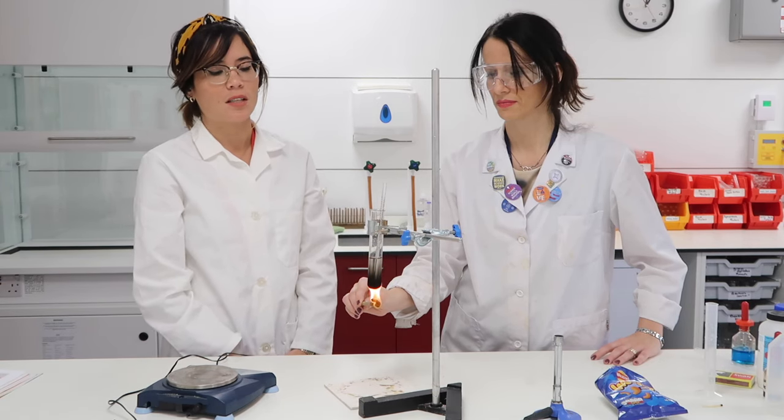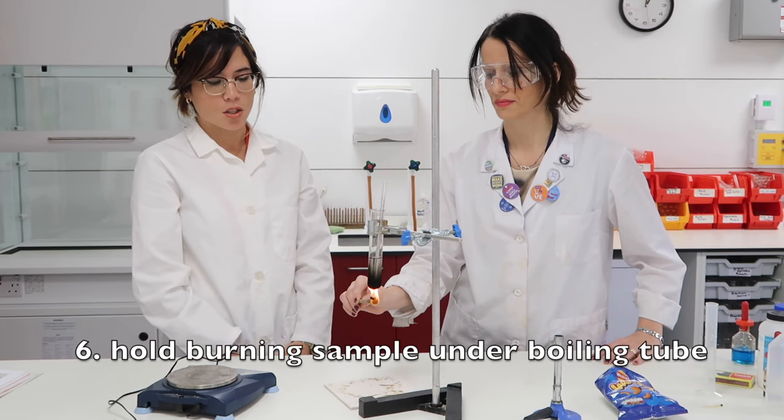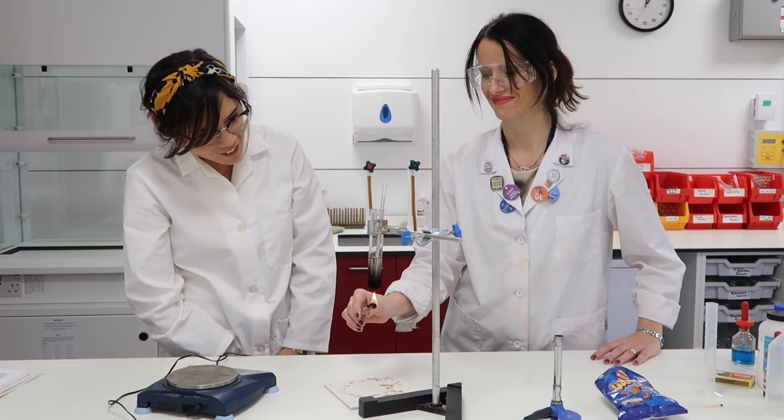Now this is the crucial part of the experiment — we're using the heat being generated by that burning Wotsit to heat the 20 centimetres cubed of water. That's amazing, the temperature is really rising!